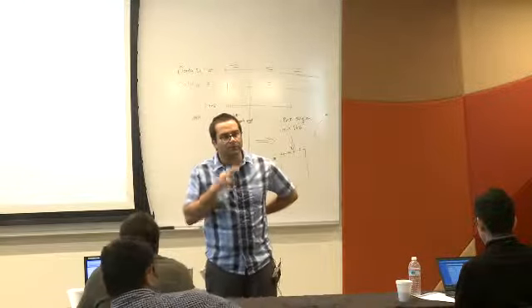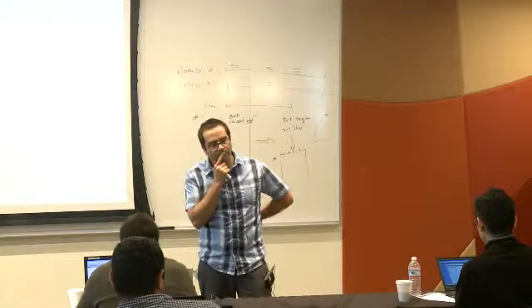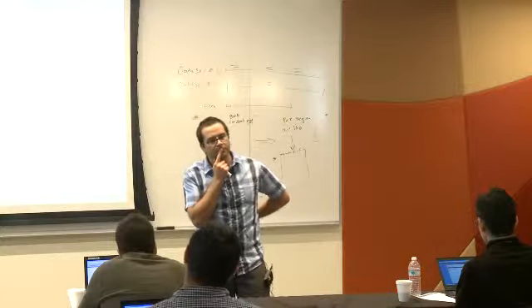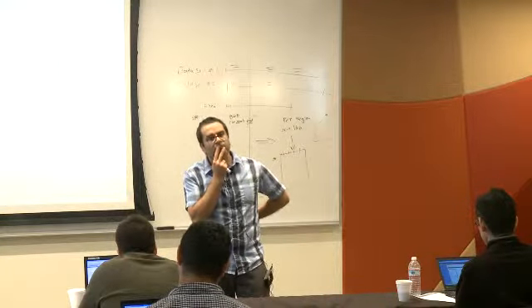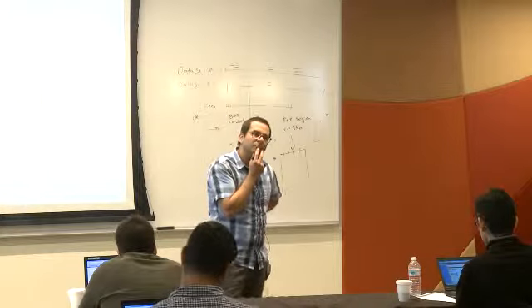Yes. And they're not pairs of sequences, they're just individual, a long list of individual sequences. Anyway, the point is, short sequences, you have a long list of them in each file. You have 2 files, and you want to compare them. My question is, how are you comparing them? And you drew a scatter plot, what were the horizontal and vertical axes?